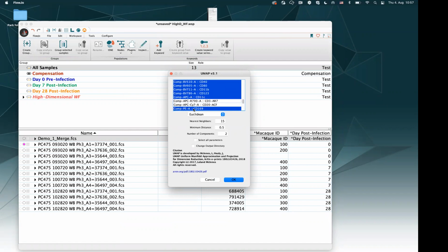And of course, here in those cases, in UMAP and PaCMAP, we have some optional tunables, again, in order to adjust the number, for example, of nearest neighbors, or you can also adjust the trade-off between local and global structure. But once again, start with the defaults that are set according to the papers, and only if you meet trouble or if your embedded space doesn't look well, then you can think of adjusting those values.